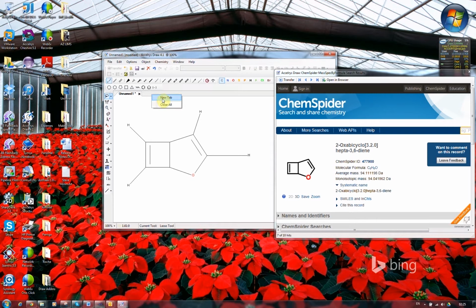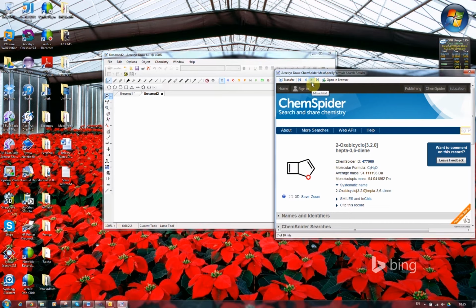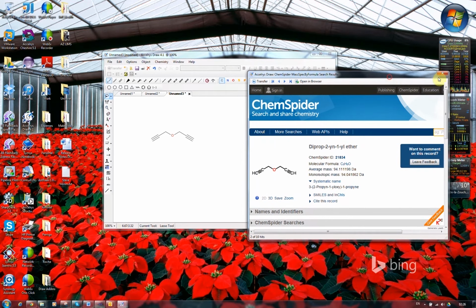If I wanted to get more than one and have them on separate tabs, I can do that. I can add a new tab, and then I can continue in this window. So let's go to another record. Let's take that one back. And it comes across into Draw. Go back to the start again. And I'll take this one too, in yet another tab. So that's how that one's working. And then when we're happy with the information that we've got, we can close this.